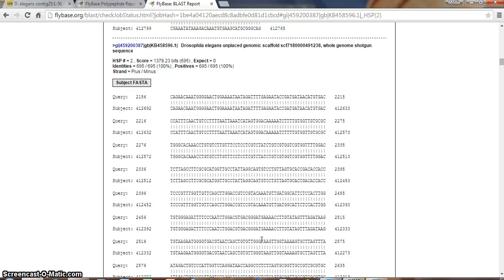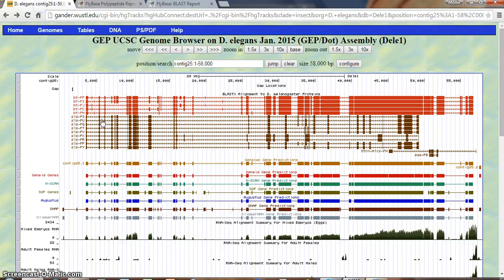Okay, and so now we have our beginning and ending Contig, and we can go back and look at the one coordinate from that past search, which was 439983. That does fall within here, so it is possible that this BT gene might actually be where we think it is. However, what we need to do is blast this one also.